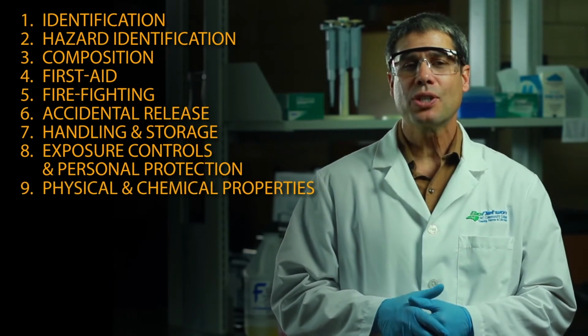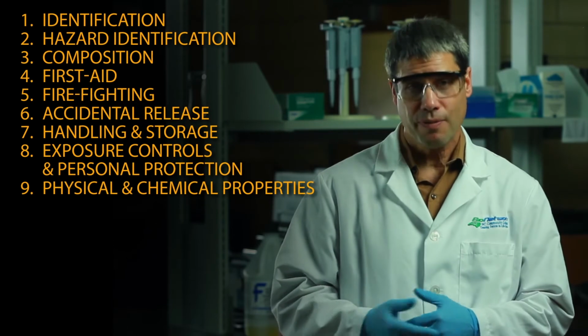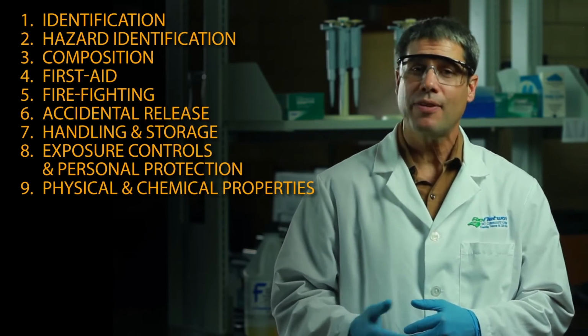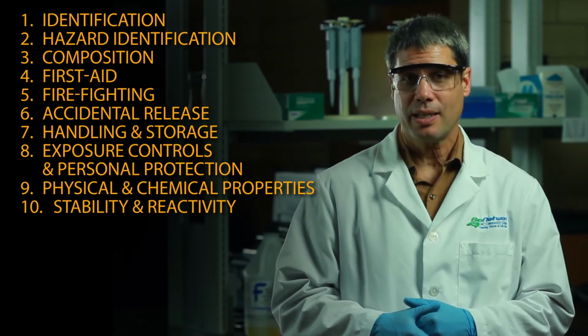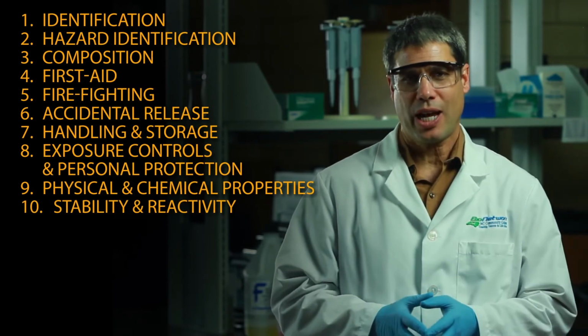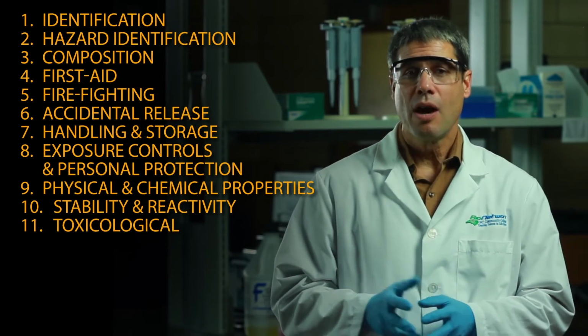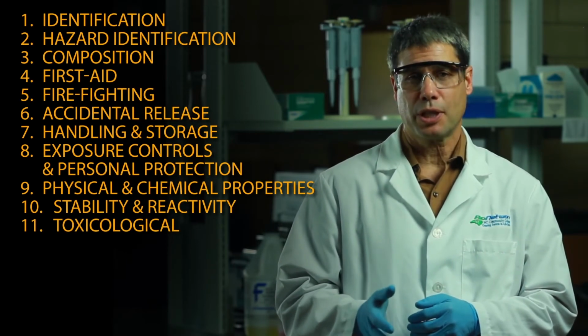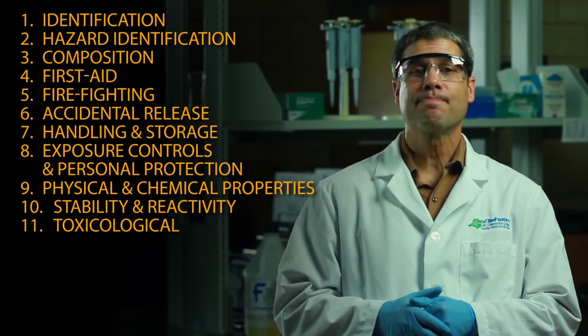Section 9, Physical and chemical properties, such as appearance, odor, pH, flash point, solubility, and evaporation rate. Section 10, Stability and reactivity. How to avoid hazardous reactions. Section 11, Toxicological information. Find out about the likely routes of exposure, symptoms, as well as short and long-term effects.